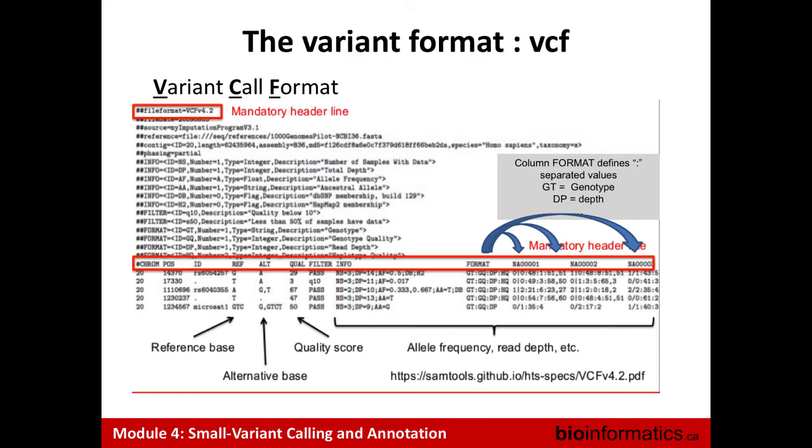Can we get phasing from the BAM file? Yes, when you phase, you usually use information from the population and also from the BAM file, depending also on the size of your reads. For example, if you use 10x Genomics to do really long artificial reads, or if you use PacBio or nanopore that have long reads, you can use this information. But in a small read approach, you could do some phasing based on the reads, but your phase block will be really small.